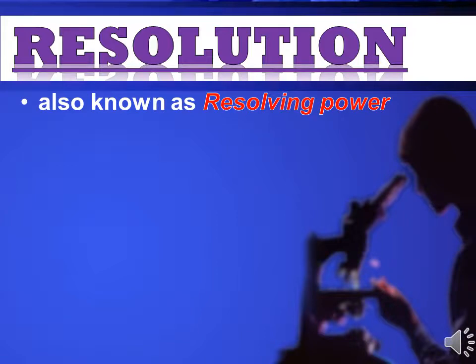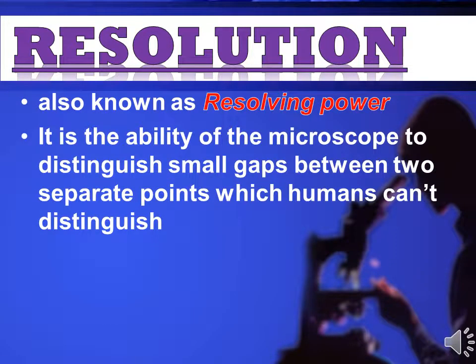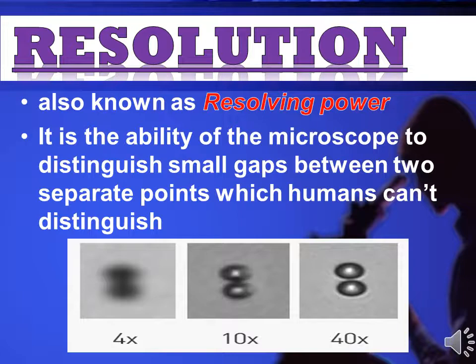Resolution, also known as resolving power. It is the ability of the microscope to distinguish small gaps between two separate points which humans can't distinguish. The picture presented best explains how resolution works.